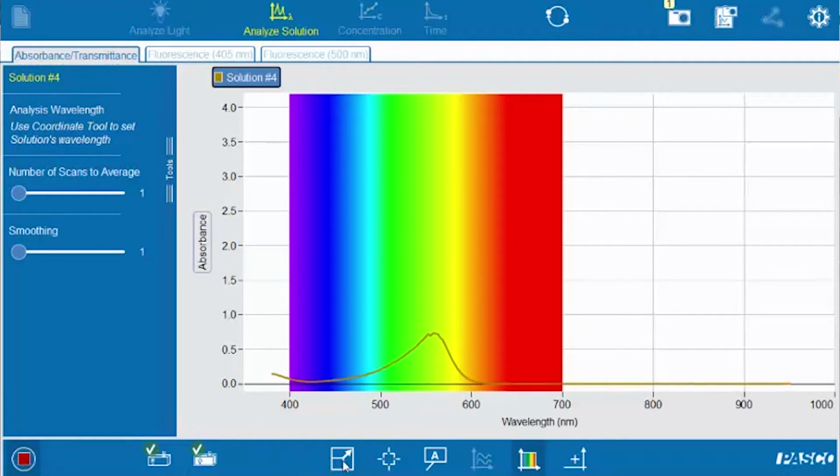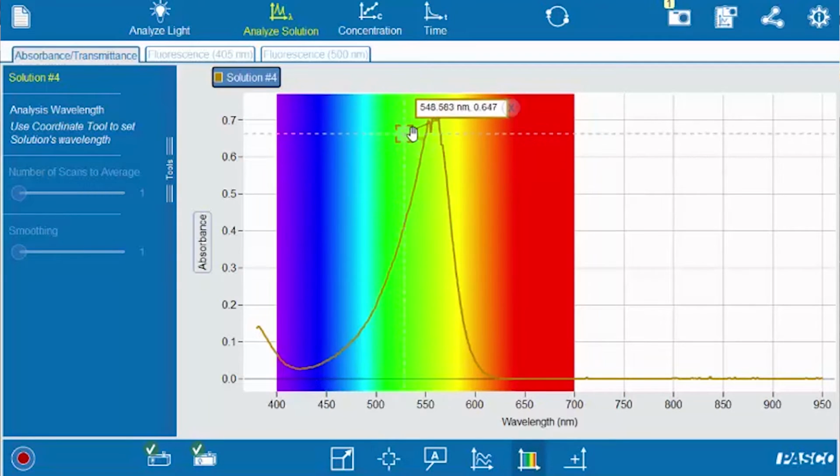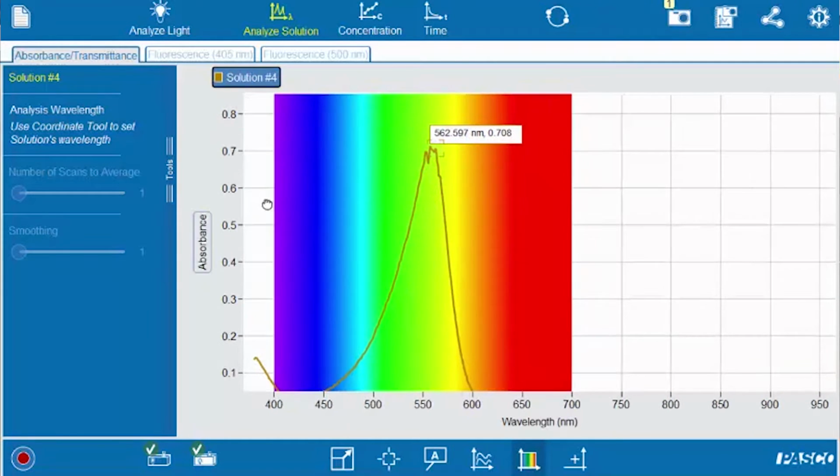And then I'm also going to use my scale to fit button just to make this a little bit easier to see. And you can see that what we have is a nice peak. Our solution is absorbing light in the wavelengths of about 500 to 600 nanometers. I press stop. And then what I need to do is determine what wavelength this is right here where we have the maximum absorbance. So we have an add coordinates tool, and I can drag that over, and I can even nudge to the left or the right.